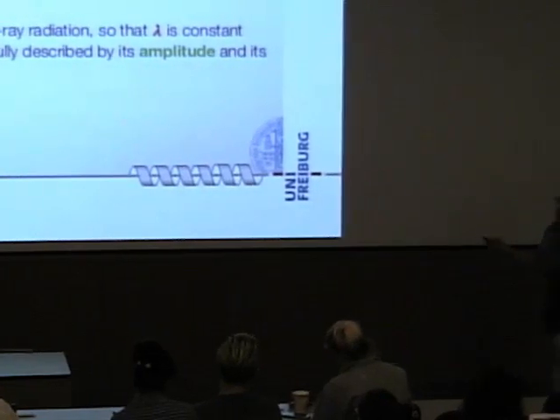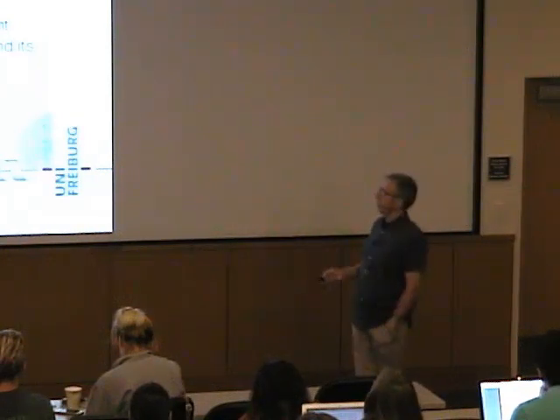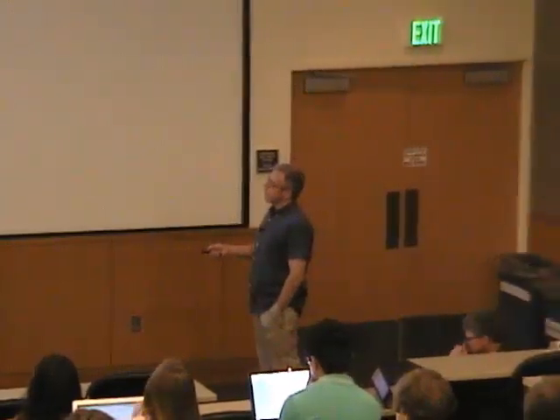So everything we send onto our crystal and everything that comes out of our crystal has the same wavelength, which means we can ignore the wavelength. Okay? And that means we get to a simple description like that. So a simple cosine function that has 2 parameters, an amplitude, we call this absolute value of f, I'll tell you why in a moment, and a phase angle.